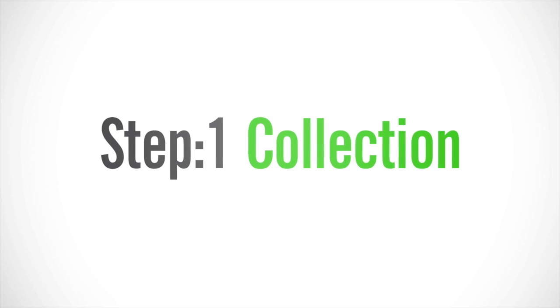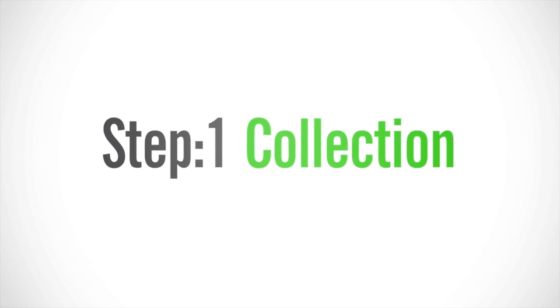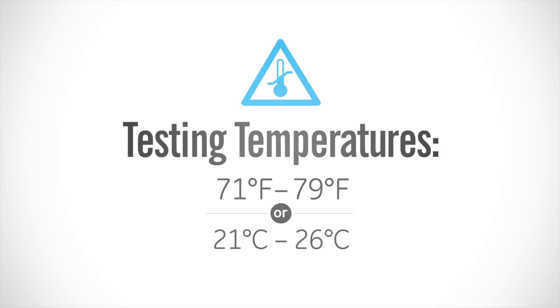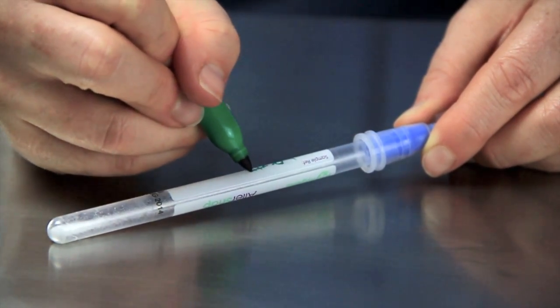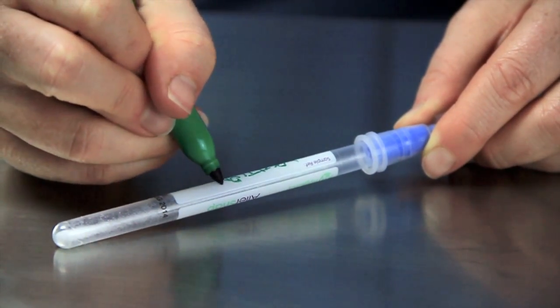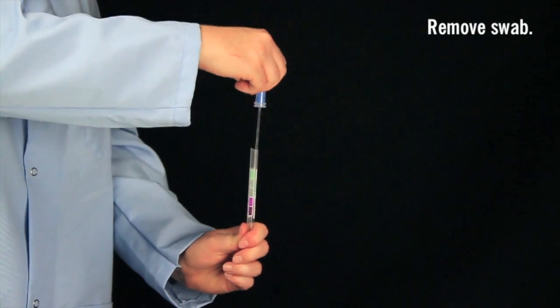Allersnap is a three-step test. The first step is collection. Allow Allersnap devices to equilibrate to room temperature before use. Write the test location on the label for easy identification. Remove the swab from the tube.